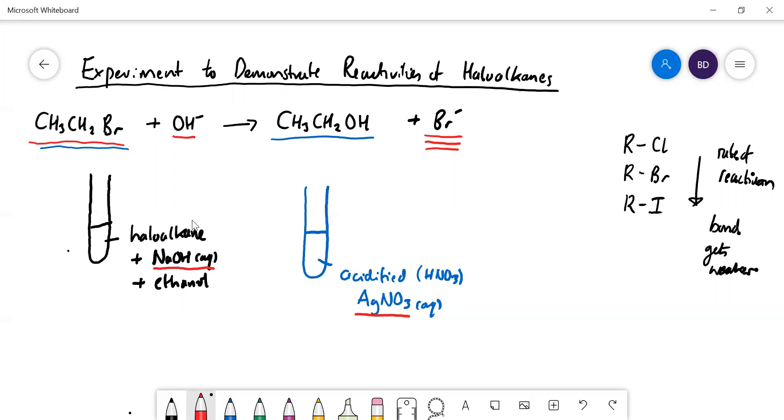All the silver halides are insoluble so you're going to get a precipitate. When chloride ion is released you get a precipitate of AgCl which is white. With the bromide ion you will get silver bromide which is cream, and with the iodide you will get a yellow precipitate of silver iodide.